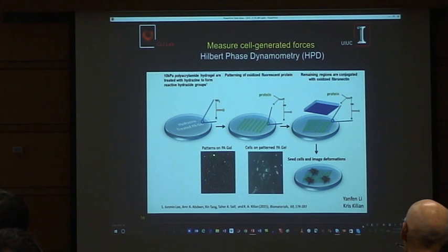You see what I mean? So we are applying the same phase reconstruction algorithm from DPM, from this off-axis method, except that the meaning of it now is displacement. Essentially you convert the phase, 2 pi phase corresponds to 1 wavelength of that grid. So if you have a grid of 6 microns and you measure 2 pi displacement, that means that displacement right there is 6 microns.